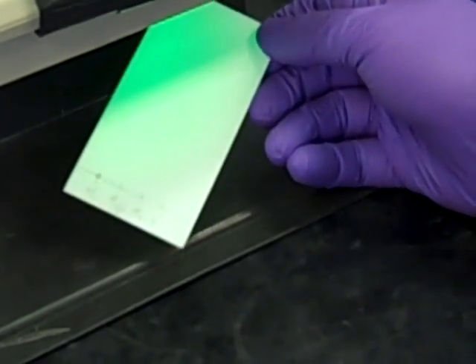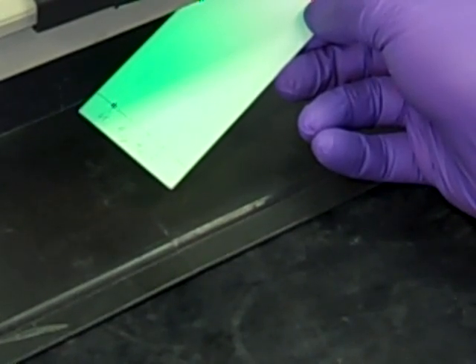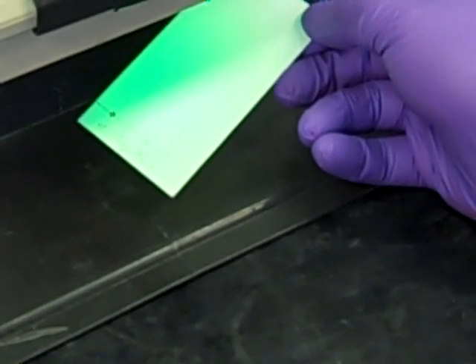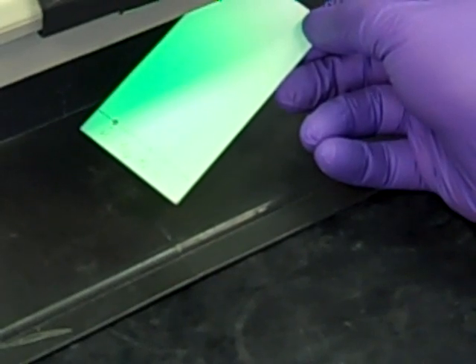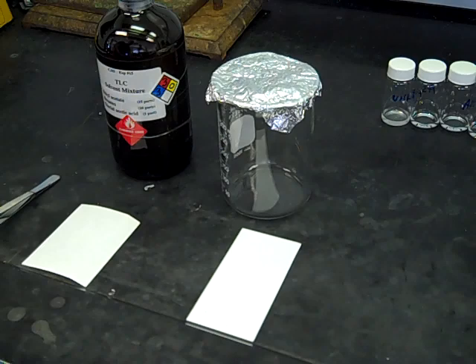It's kind of difficult to see from that distance, but you can actually see a dark spot right there on that first lane. That means I've spotted enough to get a visualization once I'm done with the TLC run. You can do that with each of your spots to make sure you've spotted correctly.